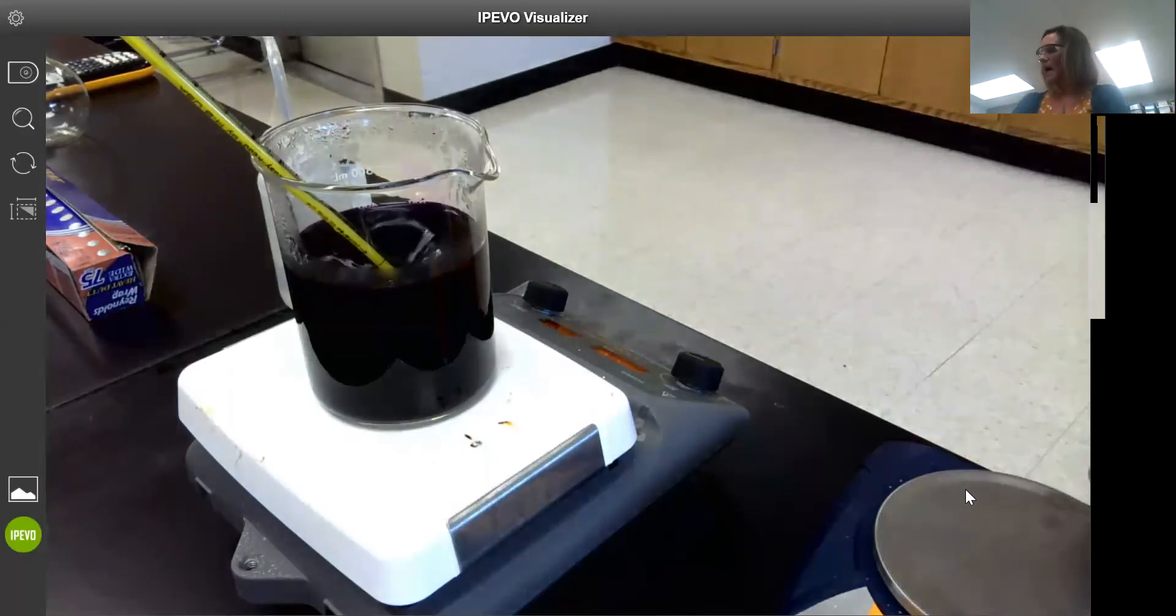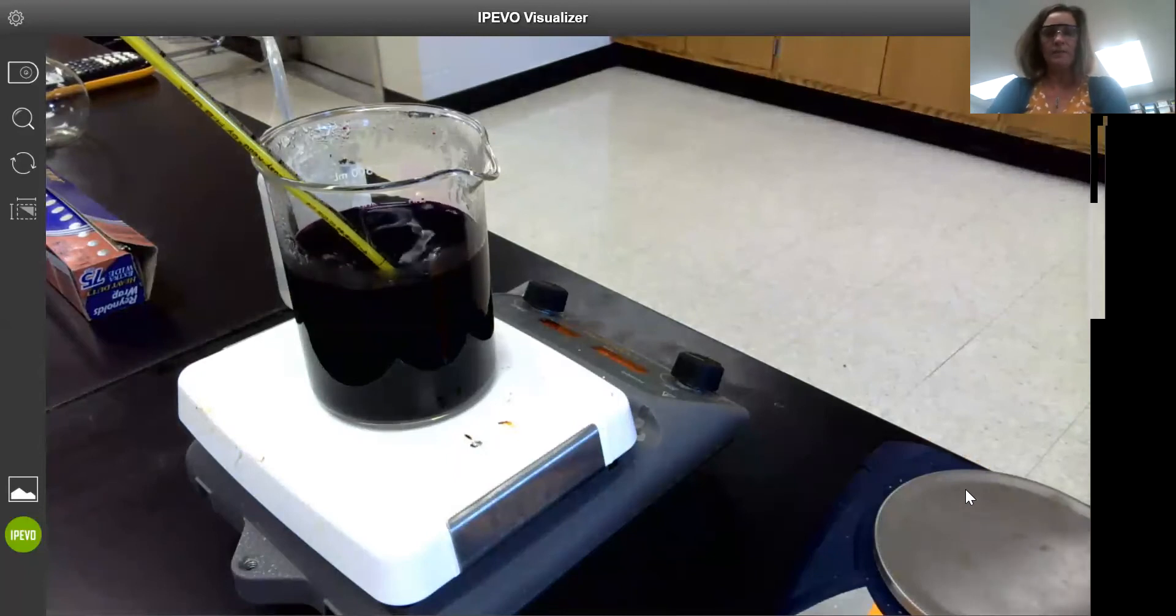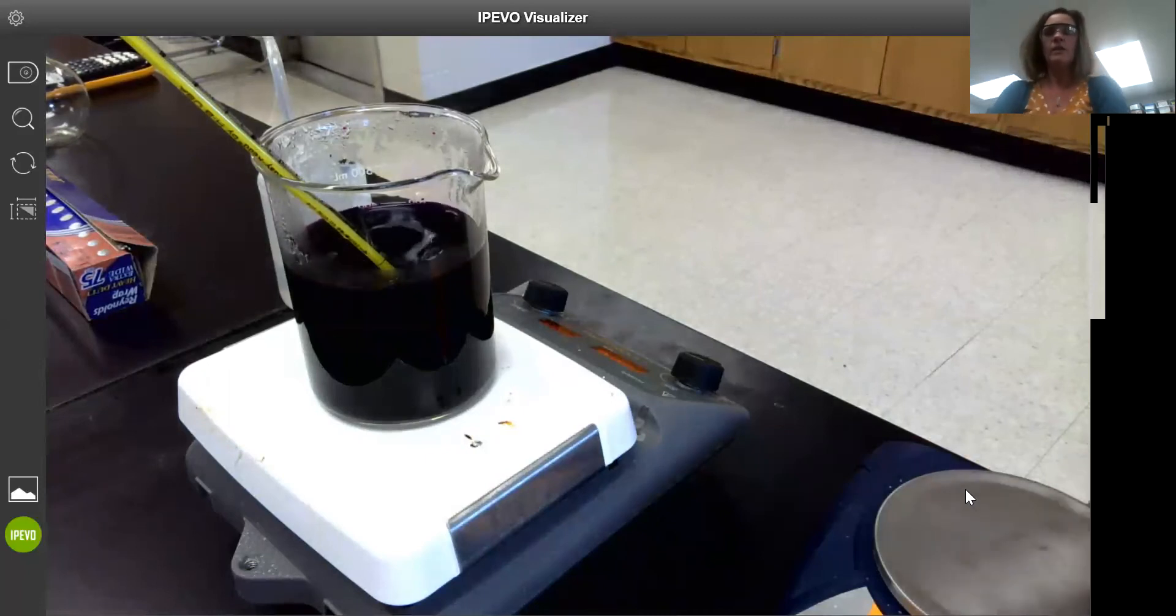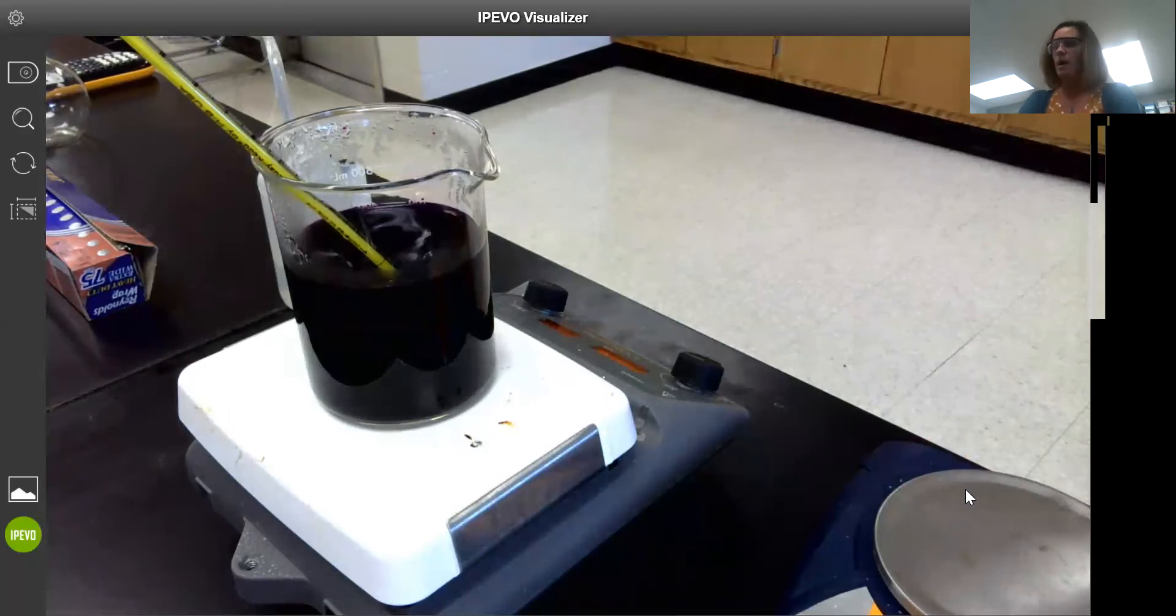Now it doesn't matter exactly how much KMnO4 that I put into the solution because we're going to be standardizing the KMnO4 solution in the first part of this lab by doing a redox titration. Titration is a technique to get a very accurate measurement of the concentration of a solution by using a primary standard.